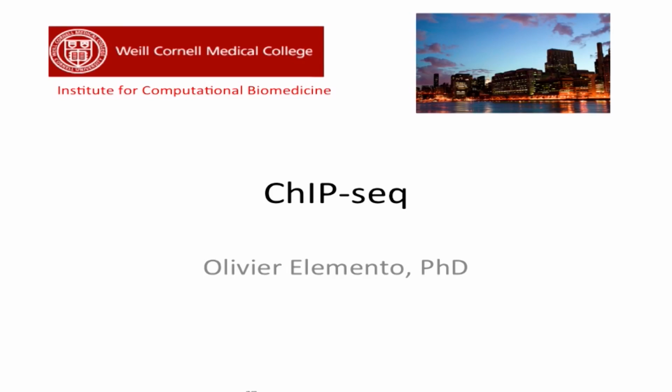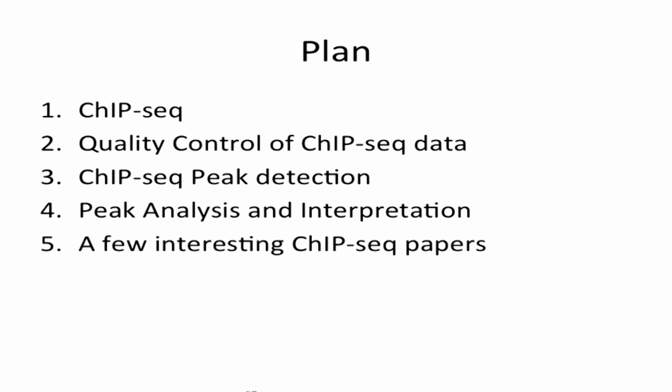This is the plan of the lecture. We're going to go over the way that people do ChIP-seq experiments and some of the technical details that are, again, useful for interpretation of ChIP-seq data. We'll go over some quality control aspects of ChIP-seq data. We'll talk about peak detection for ChIP-seq. And we'll talk about peak analysis and interpretation, basically peak annotation. And if we have time, we'll present a few interesting ChIP-seq papers.